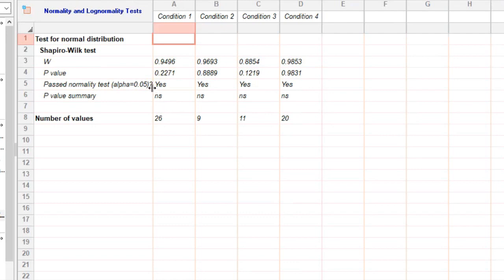However, if the p-value is less than the Significance Level, you have evidence to suggest that the data does not follow a normal distribution.